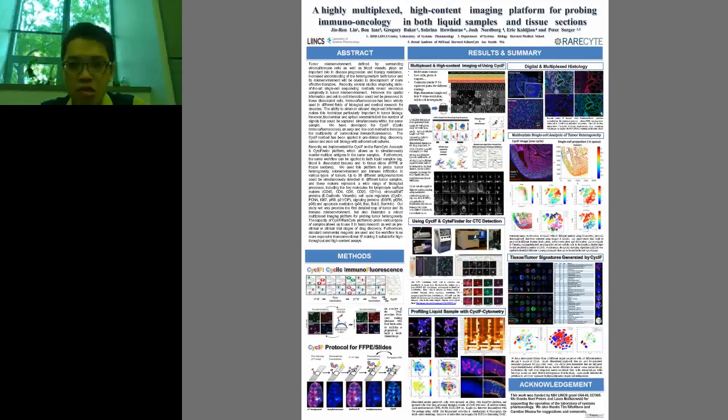So now if we just run one particular case, here is a pancreatic cancer sample, and you can actually extract each single cell's data and do what we call the digital representation, as you can see right here. You can clearly see it captured almost 100% of the image shown here. But not only that, you can extract all the single cell data and do the dimension reduction we showed before in the image cytometry setup, as well as look at all kinds of signaling correlation with this kind of spatial resolution.